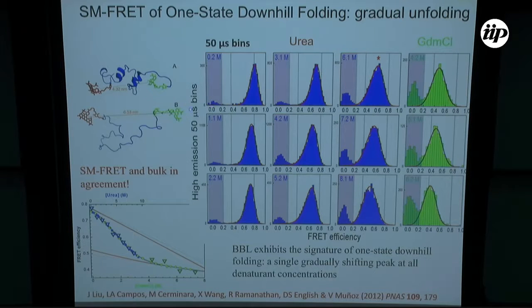By the way, this is coming from blinking. Okay, this thing at 0 is an artifact that appears because when the molecule is blinked, normally the one that is blinked is the acceptor, because the donor has a very short lifetime because it's always transferring. So the one that gets blinked is the acceptor. And when the acceptor is blinked, the molecule looks like it's only donors, it's only green. So it looks like 0 FRET, right? So that's a very well-known artifact.